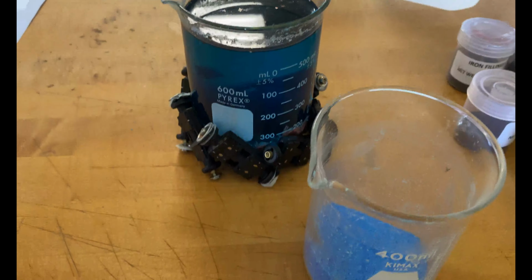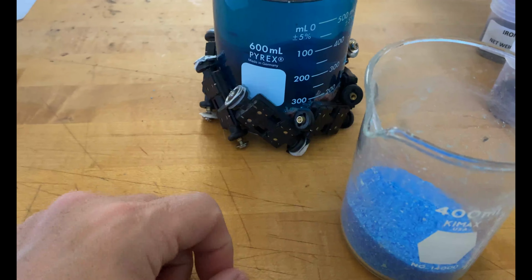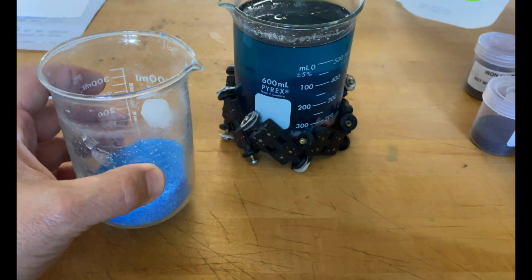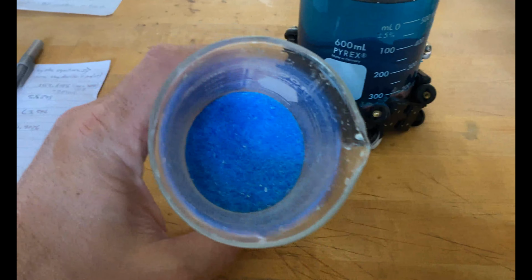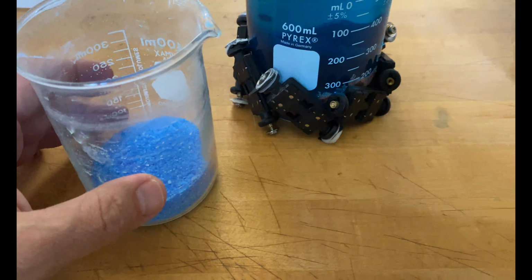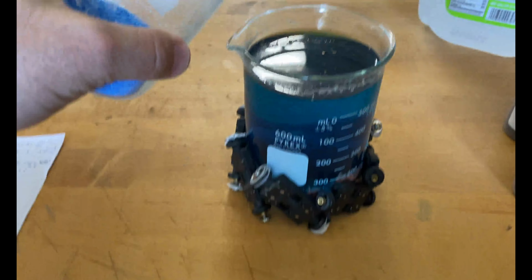After sitting overnight, the bottom edge has some black material down in it. So I'm going to go ahead and add the rest of the copper sulfate to account for the form that this is, which it looks more like copper sulfate pentahydrate. So to adjust for that molecular weight, I need to add another 90 grams. So let's go ahead and do that.